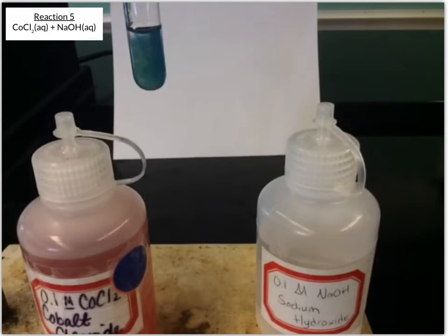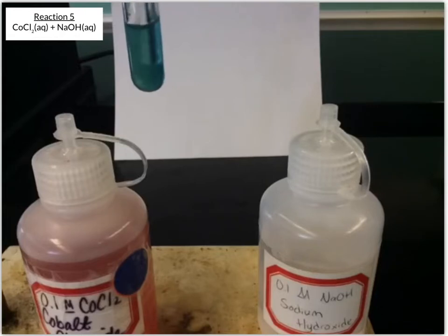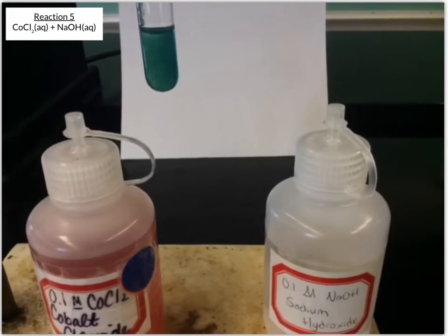And so you can see it looks kind of cloudy, or it's got this weird texture in there. I'll go ahead and mix that. And then we're going to give it a few minutes to sit and settle because you see that kind of speckling in there. That looks like there's some solid floating. So we're going to give it a little bit of time, see if this bluish turquoise coloring settles as a solid.